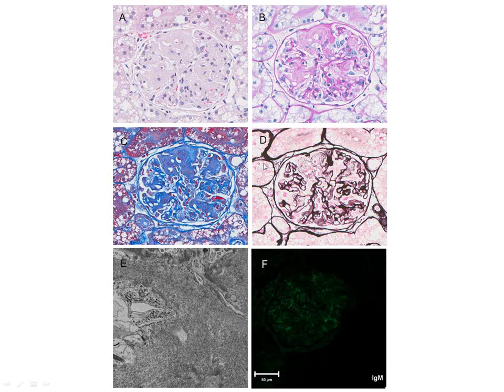George, do you have anything else to suggest about this case? If you look at amyloid cases overall, in general, you get an impression that the PAS and the trichrome give you suggestions that it's amyloid.